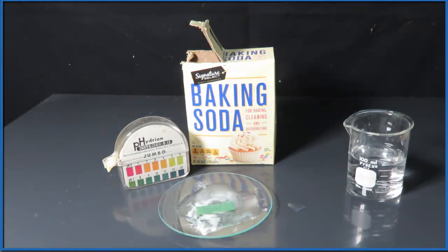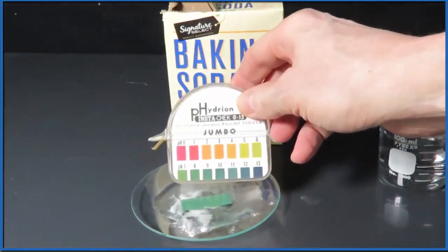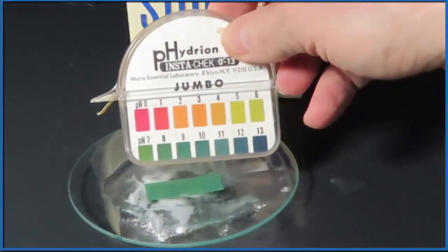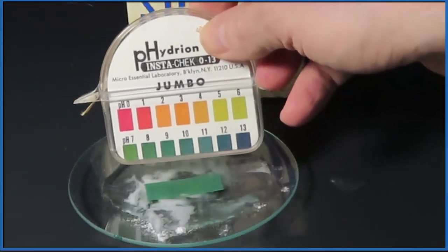And you can see right away the pH paper changes green. That green tells us that the pH is 7 or greater, and that means that we have a base.